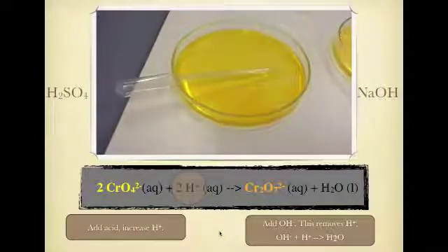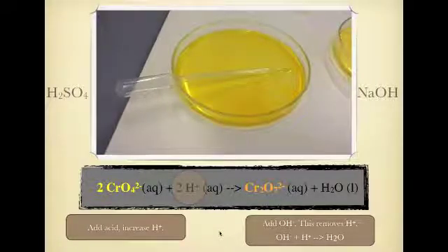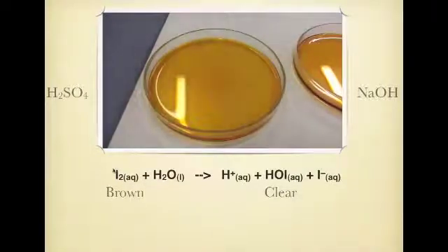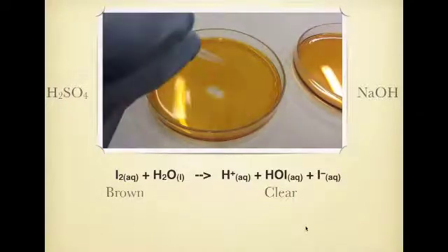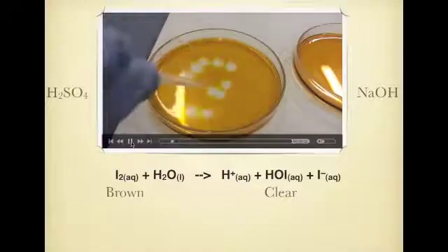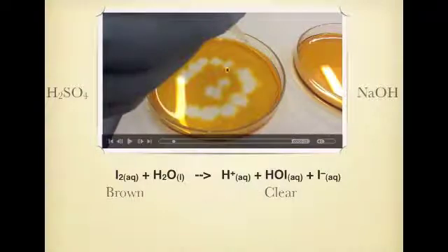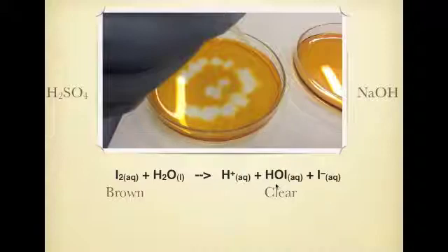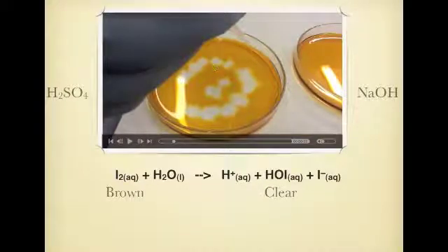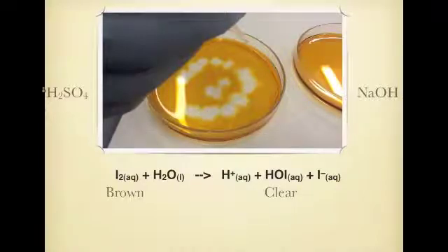Moving on to our next experiment, demonstration, is our iodine reaction where we have our brown iodine, and that's in equilibrium with this clear solution, which is HOI. Now, what I want to talk about is what we're doing here. Obviously, we've got the addition of something with our pipette, and it's becoming clear. Is this going to be sodium hydroxide, or is this going to be sulfuric acid?